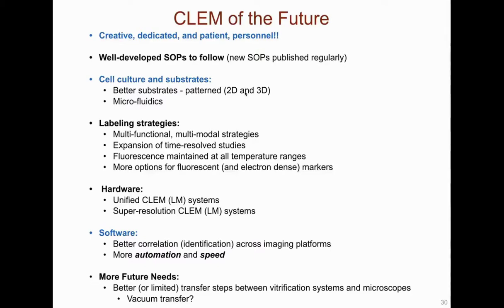We are also engaged in developing improved automation routines through software and hardware advances, which we will discuss in our next webinar series. As you have seen throughout the webinar, we have a robust workflow for cryo-CLEM studies of cells and virus-infected cells. This workflow relies on tools from Alvéole Labs and Leica Microsystems, mainly the DMI-8 microscope with the Alvéole PRIMO system, the EMGP, and the EM Cryo-CLEM. With these tools in hand, we are developing improved routines for cell culturing, along with better automation and correlation between cryofluorescence microscopy and cryo-EM data.